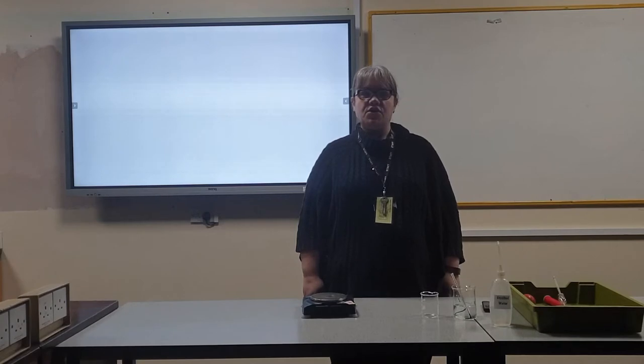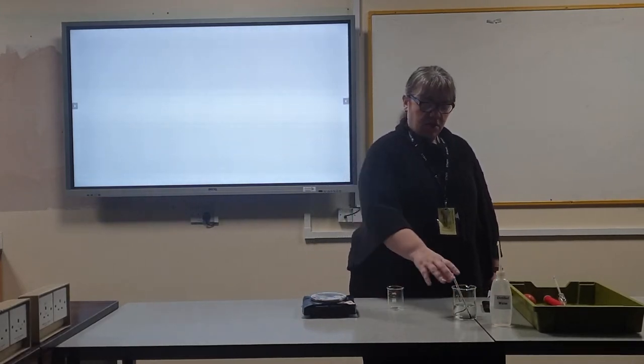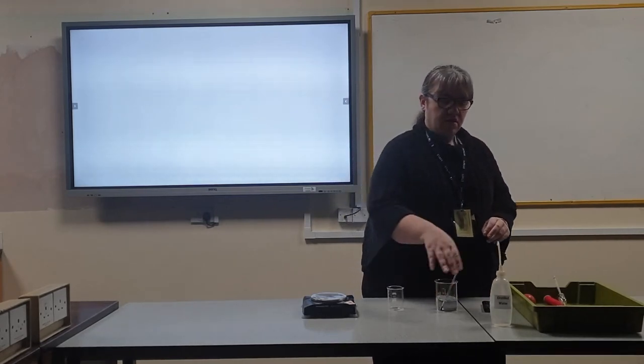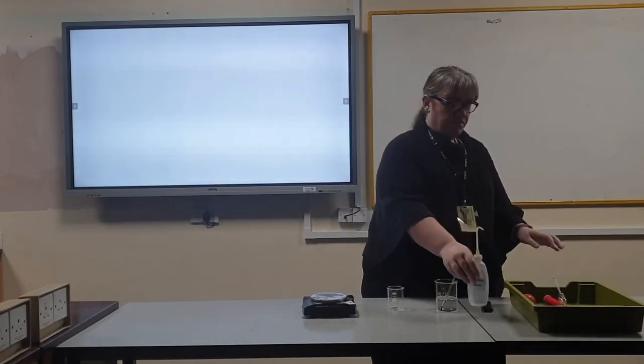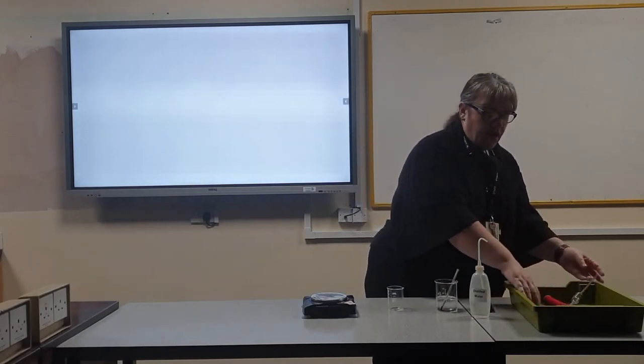Hello, today I'm going to show you how to calibrate a pipette. For this you will need a balance, a small beaker, a larger beaker and a thermometer, distilled water, a pipette and your choice of pipette fillers.